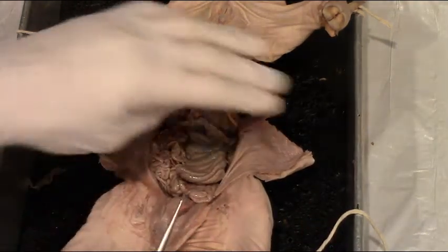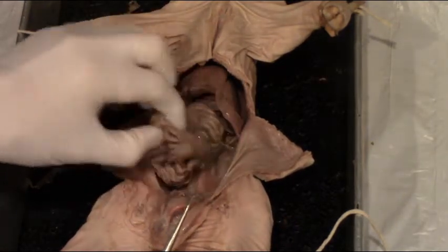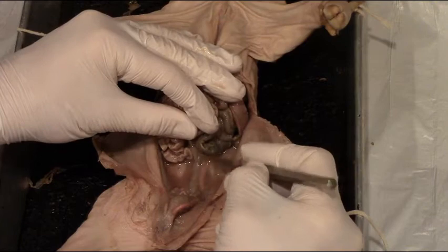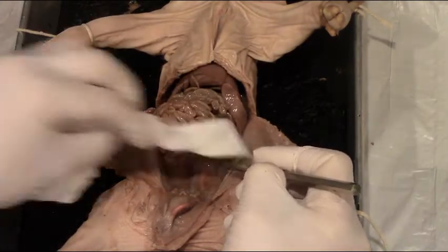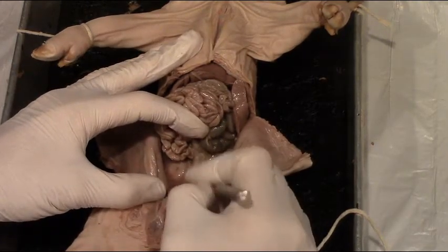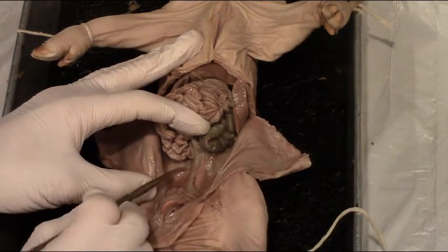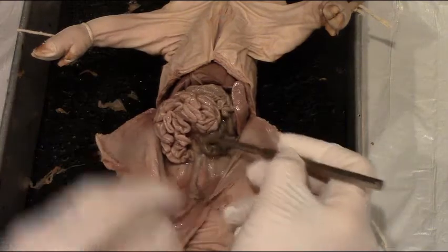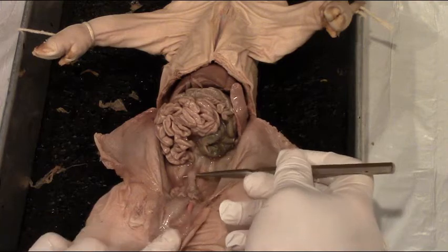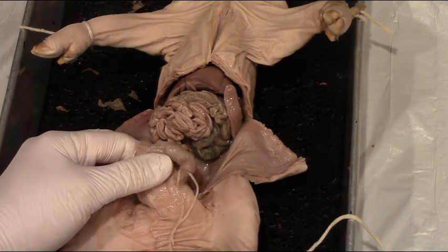A couple of other structures we can see in this area. If we move the large intestine and the small intestine, we can see the most posterior portion of the large intestine, which is the rectum. The rectum carries undigested food — solid waste — from the large intestine out of the body. It's a big green tube usually right along the back of the pig, and it leads out to the anus.